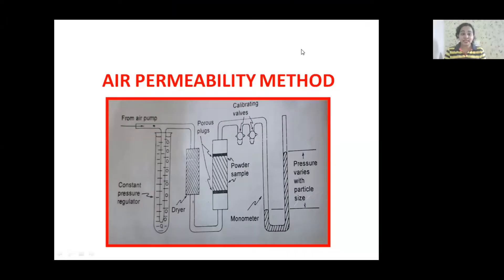The Fischer Sub-Sieve Sizer instrument is used for the determination of surface area of a powder. Let's see all the points regarding the air permeability method. This is the Fischer Sub-Sieve Sizer instrument assembly. I will explain all the important parts associated with this instrument.